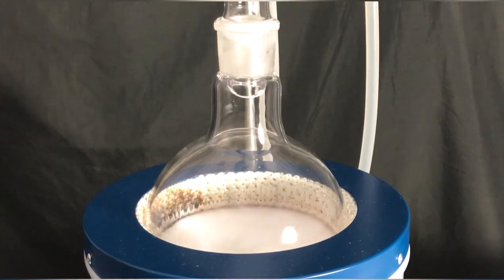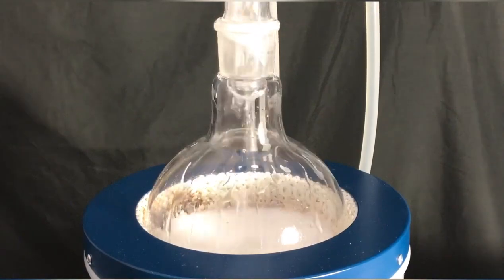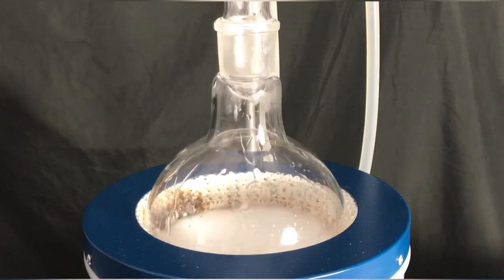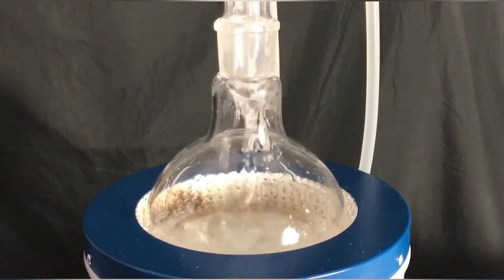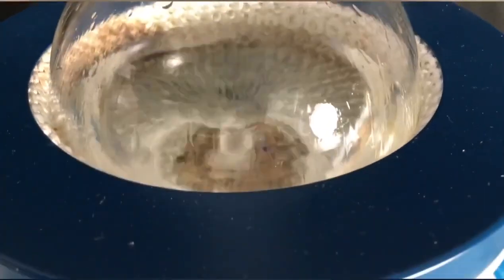After the 7 hours have passed, 220 milliliters of boiling distilled water were added to the reaction flask through the top of the reflux condenser. I chose to add it this way to flush down all of the barbituric acid that had settled in the condenser. Heating and stirring were continued for 10 more minutes until we were left with this clean solution.